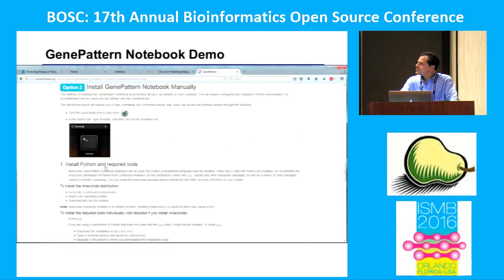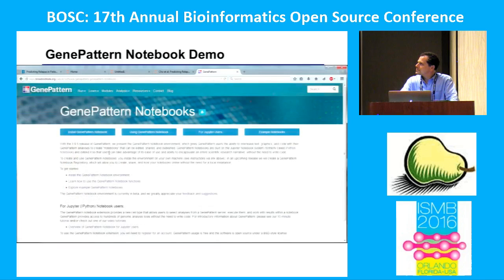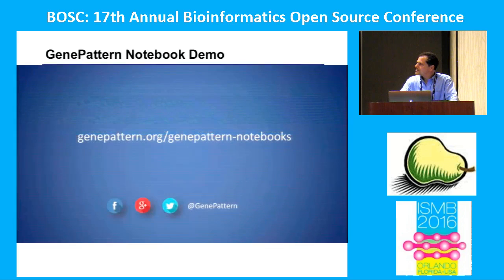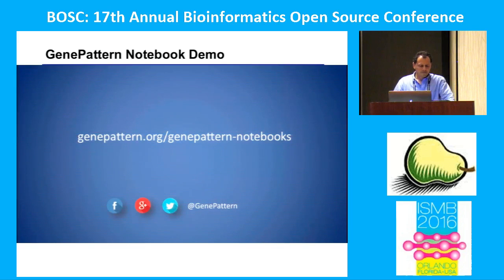You've now been introduced to the GenePattern Notebook environment — a seamless integration of the GenePattern interface and the Jupyter Notebook — and have been shown how easy it is to use and install for non-programming and programming users alike. For more information, tutorials, and examples, please visit genepattern.org/genepattern-notebooks.